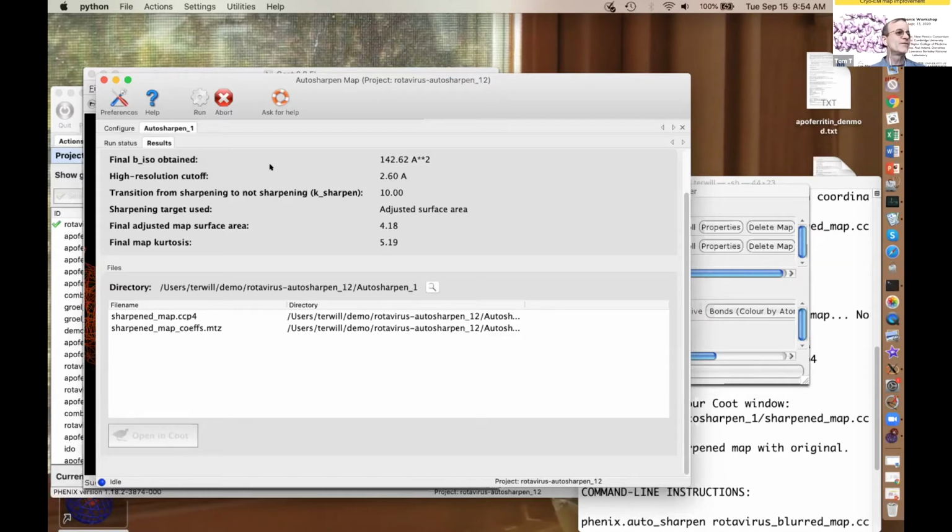Okay, what map to use for further steps? Generally speaking, you're going to come in with two half maps, maybe a full map from Relion or whatever program you just ran. And you're going to auto sharpen your map as a first cut. And if that map is more clear than your starting map, use that map. Once again, at this stage, you haven't really lost or gained anything fundamental in the map, but you could imagine that if you did refinement against that low resolution map, it wouldn't work nearly as well as refinement against the high resolution version. So basically, at this stage, you're going to want to take the map that is the most clear and use it for your next steps for model building or refinement or whatever you're going to do next. This is also going to be true for density modification we're going to do in just a second.